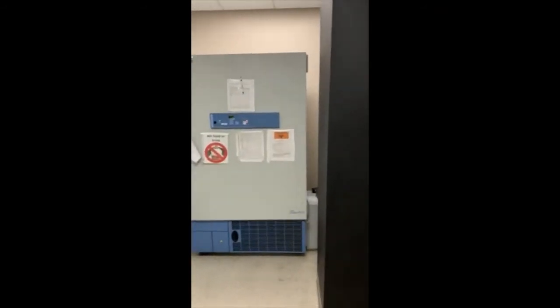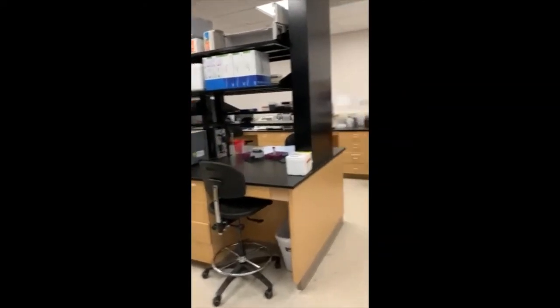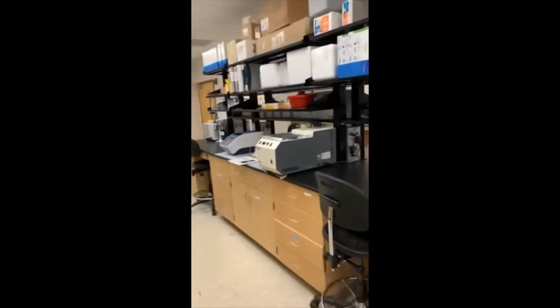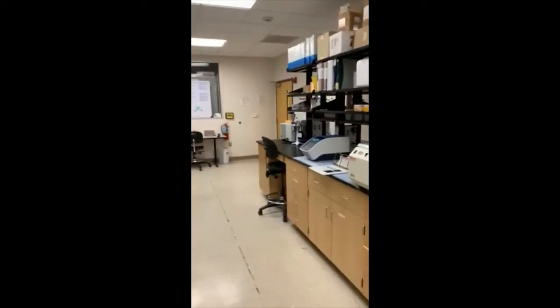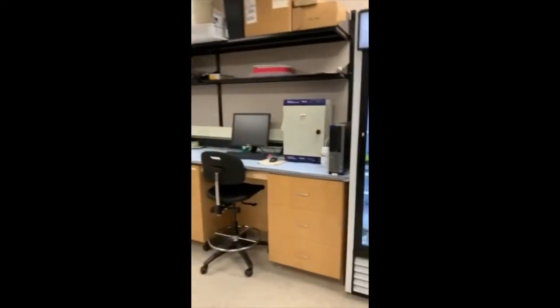A lot of the research here in the Sing Lab does deal with the decomposition process. For this, we've had large field studies that really allowed us to survey this timeline of decomposition, which is going to allow us to make better inferences about some crime. We also were able to get insect and microbial evidence. This is really important because we need to see how those specifically impact that decomposition process.